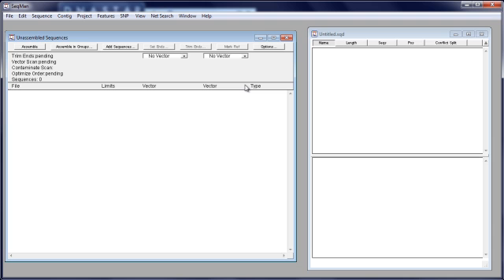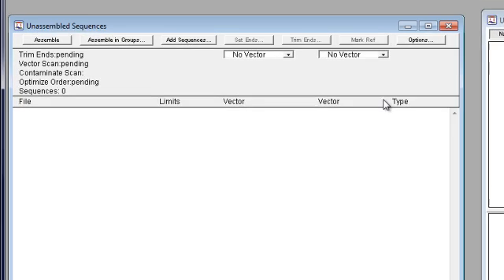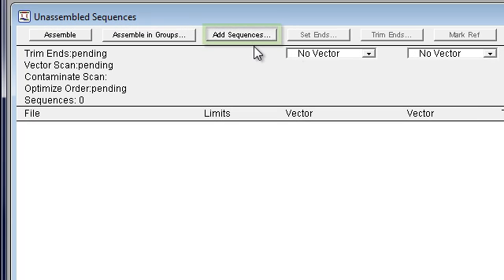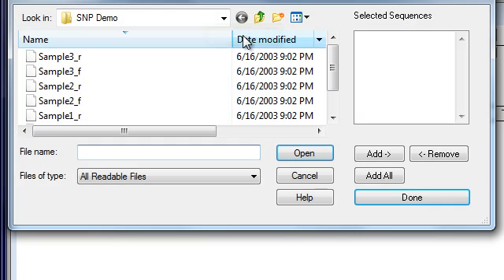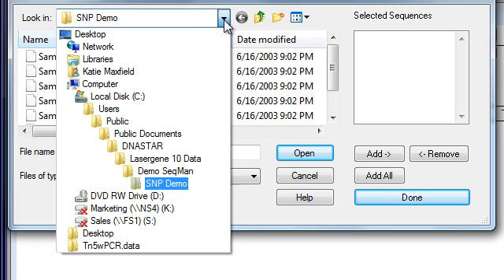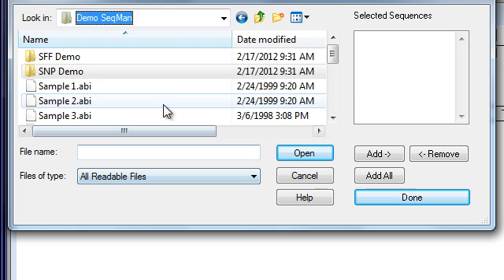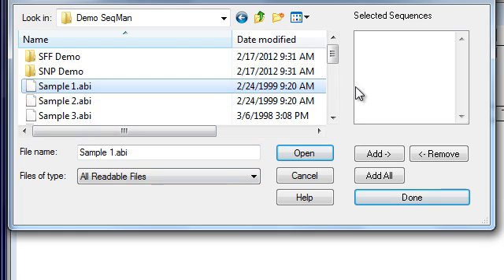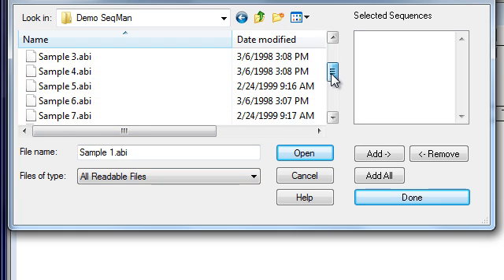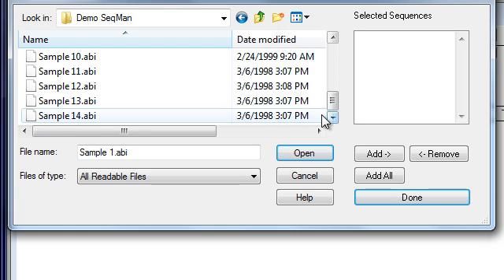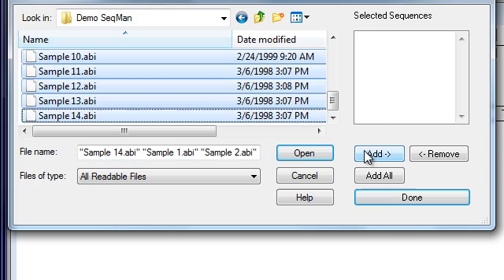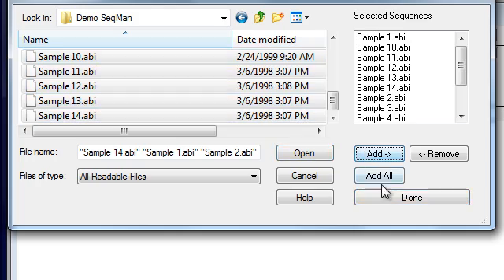When you first launch SeqMan Pro, you'll see the Unassembled Sequences window. Here, you can click Add Sequences to add your read files and your reference sequence if you have one. For this example, I'm going to load these 14 ABI files from the demo SeqMan folder, which is installed with LaserGene.